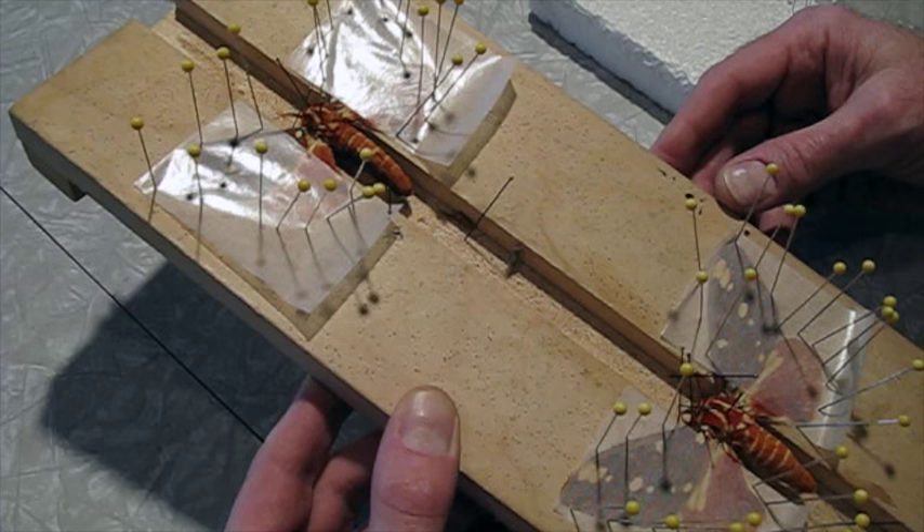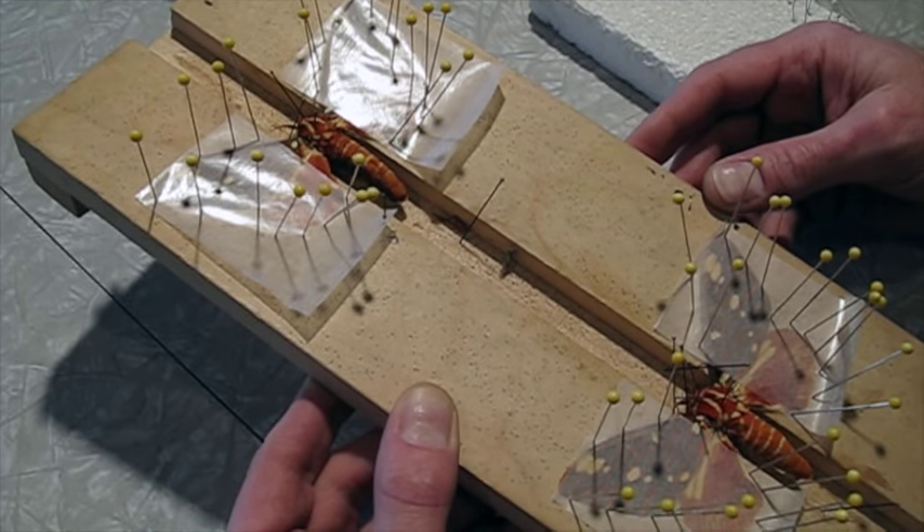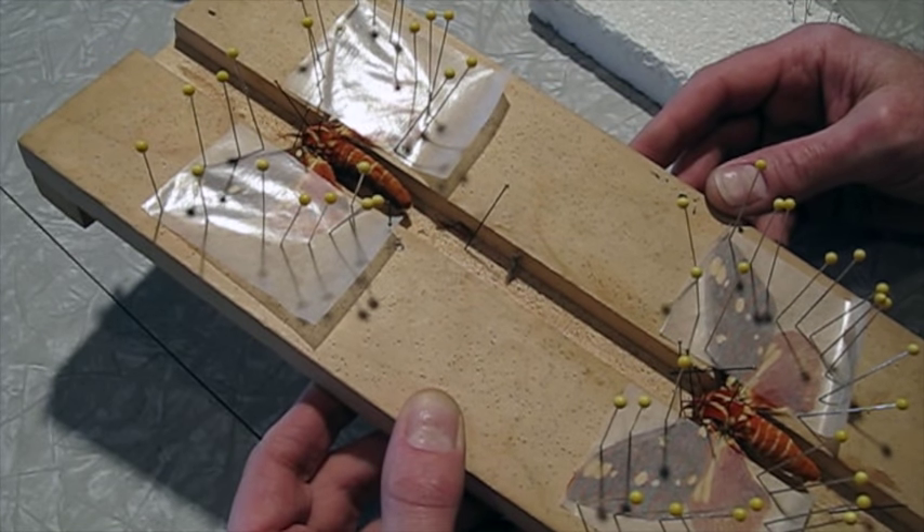So these were pinned up a while ago, and they're all dry now. So I'm going to pull the pins out, and I'm going to show you a technique.